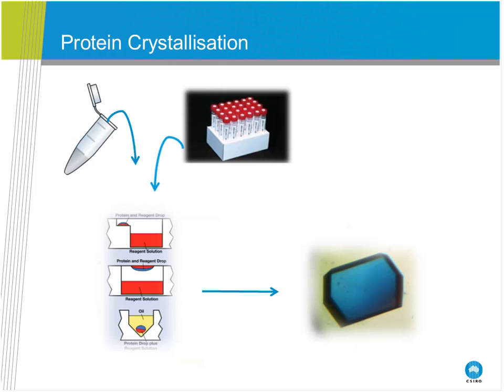That's just me. Okay, so what is protein crystallization? What we're trying to do is coax our protein to come into a nice ordered array so that we can shoot X-rays through it and get some information from it. And how we generally do that experiment is we take a purified sample of protein, we mix it with one or probably lots more of different stuff. And that stuff is often referred to as a reservoir condition, a well condition, a crystallant, a cocktail, but it's just stuff. 2 to 5 different chemicals at different concentrations.